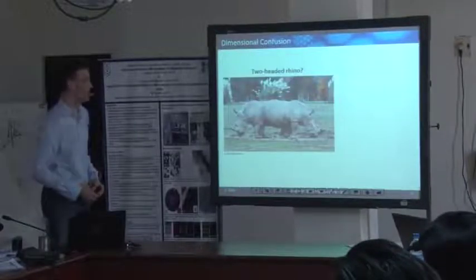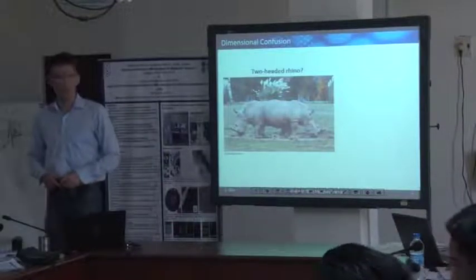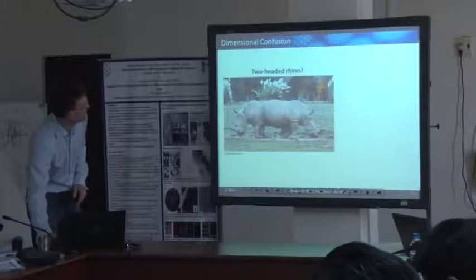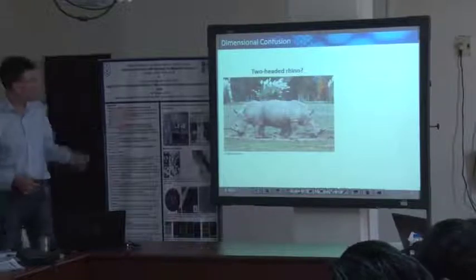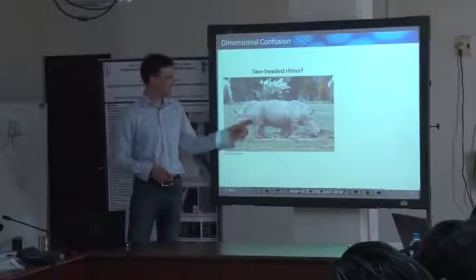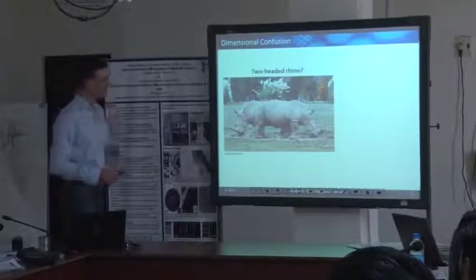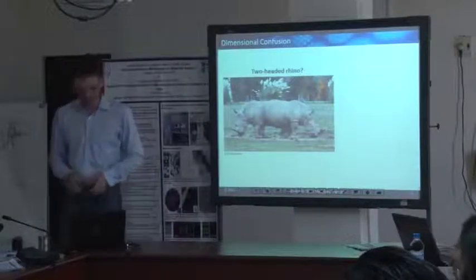Now let's come to electron tomography, because you probably know tomography from computed tomography with X-rays, for any kind of medical application. But why do people do tomography? There's a pretty funny example of 2 rhinos, and you can hardly see where one starts and the other one ends. It looks like a 2-headed rhino, doesn't it? This is what Benjamin found on the internet. It's a little bit confusing, a little bit weird.